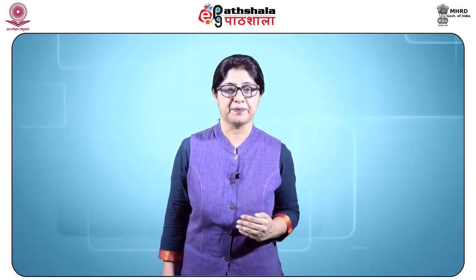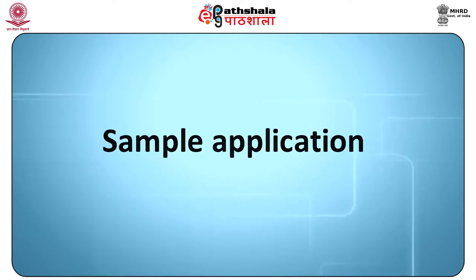TLC plate. Sample application. A Hamilton micro syringe is generally used for transferring the sample solution to thin layers for quantitative work. However, the use of capillary tubes is preferred for qualitative analysis. The solvent used for the sample solution should be volatile and as nonpolar as possible.